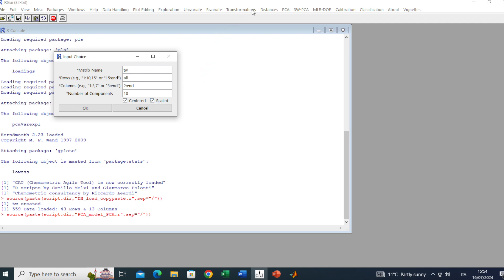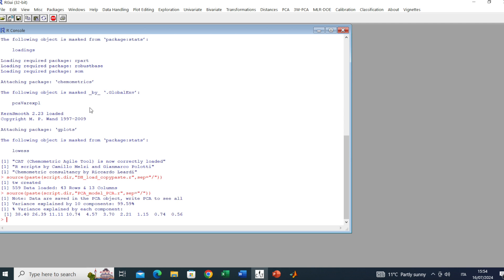We can select whether we want to apply centering and/or scaling. Anyway, for other pretreatments you should go to the Transformations menu where you can find more transformations. In this case autoscaling is fine since we are dealing with different variables with different scales and different nature, so we can go on.